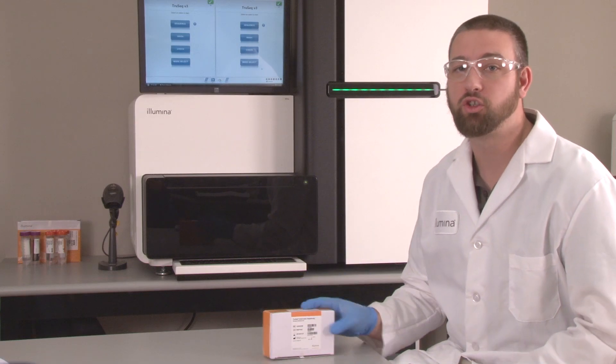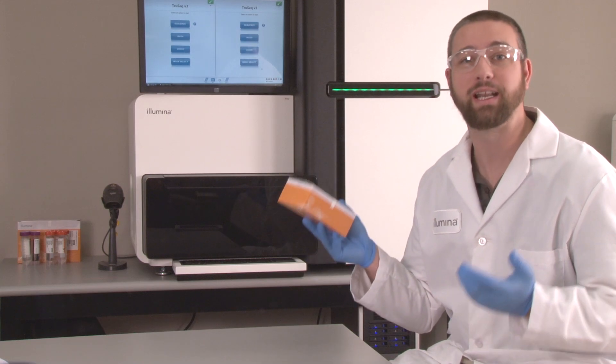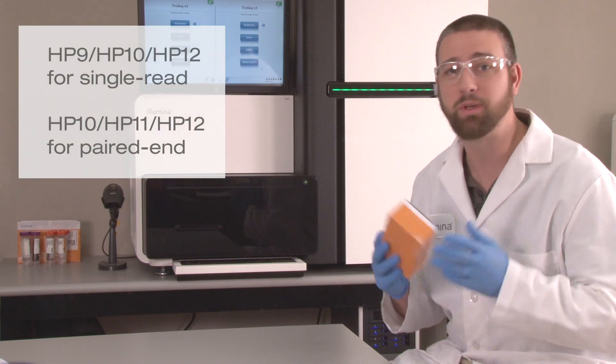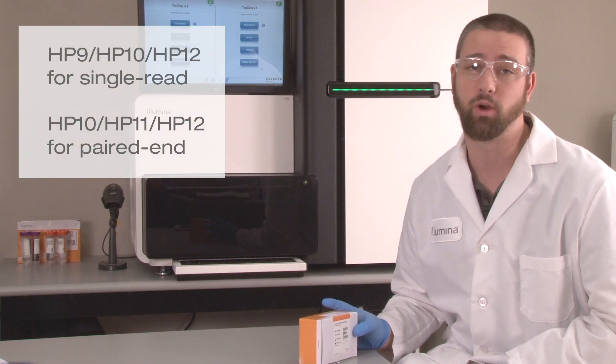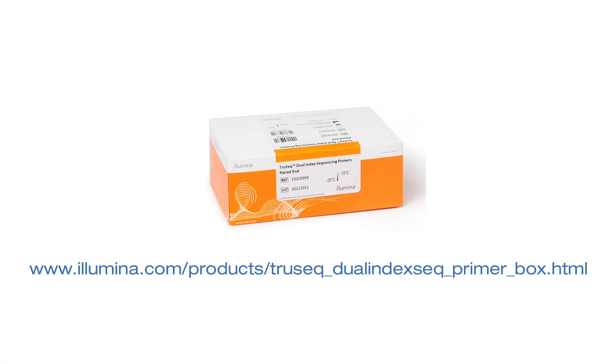These primers are available in the TruSeq Dual Indexing Sequencing Primer box, available in single-read and paired-end varieties. The single-read and paired-end kits do have different primer sets, so be sure to order the appropriate kit for your run. The TruSeq Dual Indexed Sequencing Primer box is available at this link.